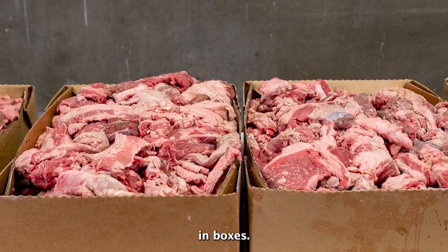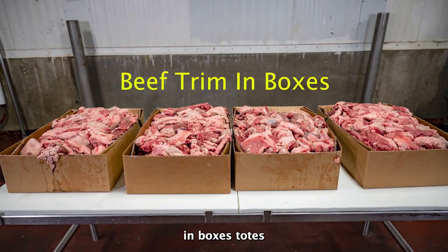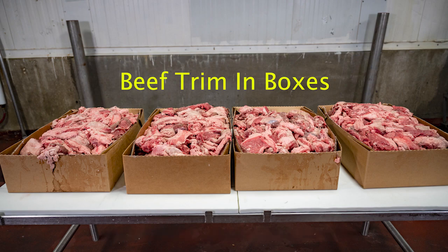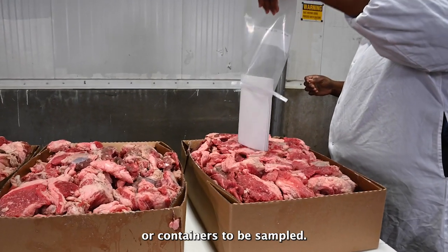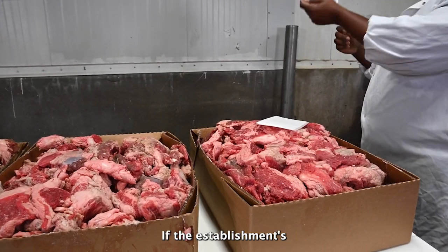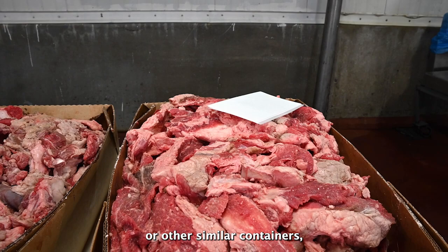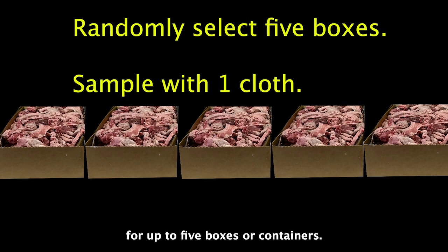Next, we'll demonstrate sampling of beef trim in boxes. You are to use this procedure if the product is packaged in boxes, totes, or any other container other than combo bins. Randomly select the lot of boxes or containers to be sampled. If the establishment's lot is composed of product in boxes, totes, tubs, or other similar containers, you are to use one cloth for up to five boxes or containers.